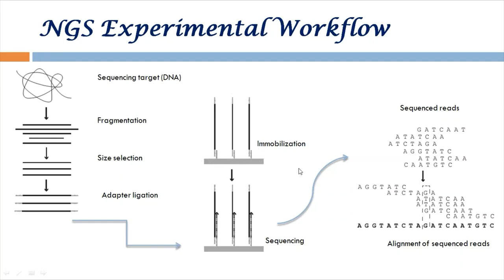They are immobilized on a platform, and then the sequencing procedure starts with the help of polymerase enzyme. Sequencing goes on, and as I told you, as and when new bases are added, each emits a signal and the chain continuously grows. There is no termination process here. So what do we have in the end? We have a set of sequences for the fragments. There are a few million fragments here, and the output is the sequence of all these few million fragments. So what is the logical next step? To put them all together so that we reconstruct the entire genome.